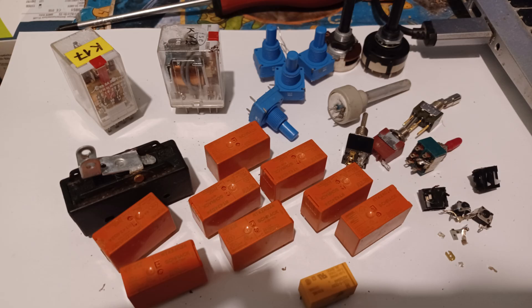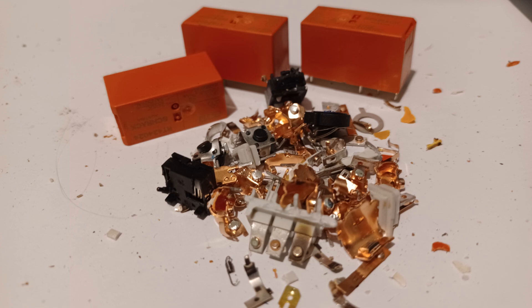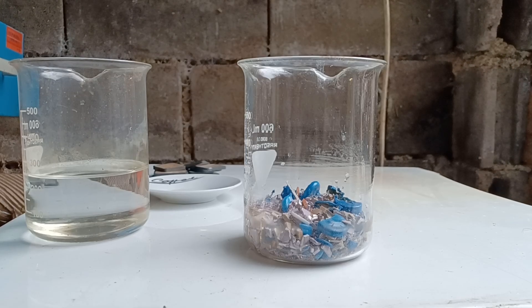Hi everyone, today I will show you how I extracted silver from electronic components. Due to its high conductivity and great corrosion resistance, silver can be found in many components. More than 1000 tons of silver is used in electronics every year — that is roughly one fourth of all silver production.